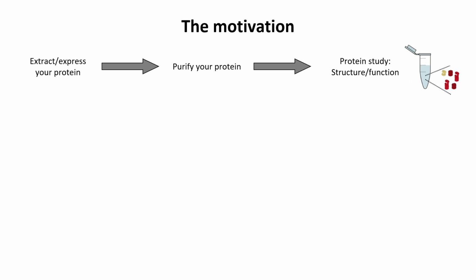And then you do your protein study, and it can range from structural studies where you use cryo-EM or X-ray crystallography, all the way to functional studies and biochemical studies.